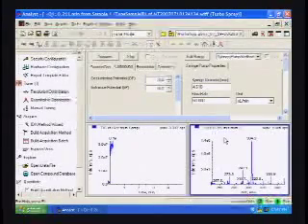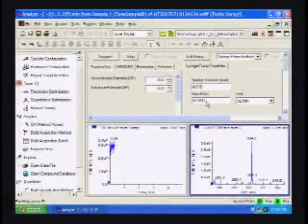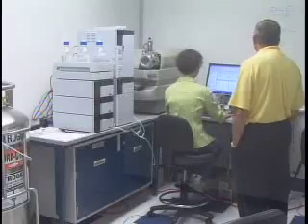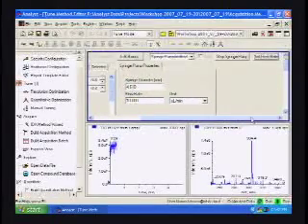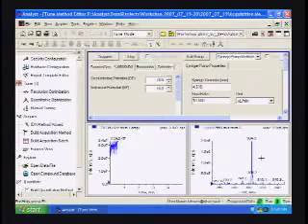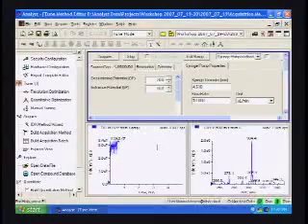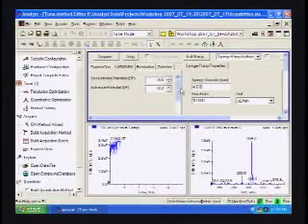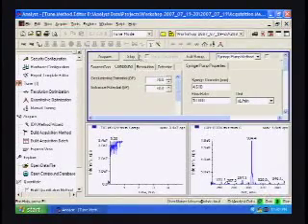Give it a little bit. I don't remember what it was before. Do you remember what the intensity was before? No, I don't. Okay. We'll go ahead and change it to 10 microliters per minute. We've got good cocaine signal intensity over here. The signal looks pretty stable right there, so let's go ahead and give it a try.